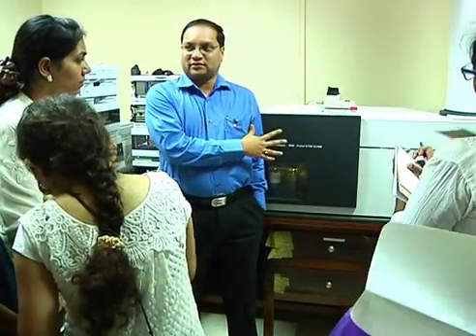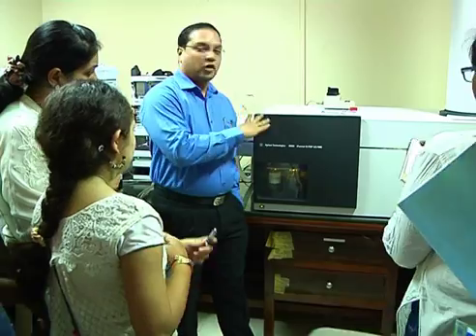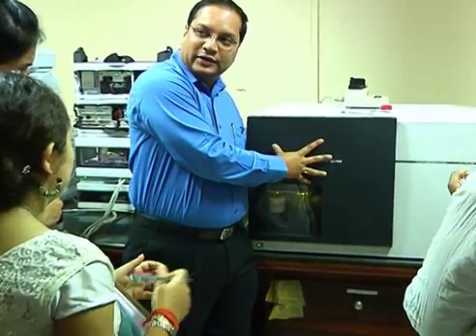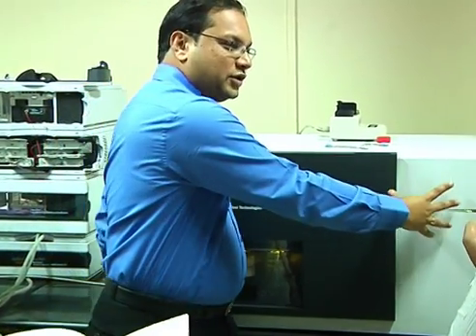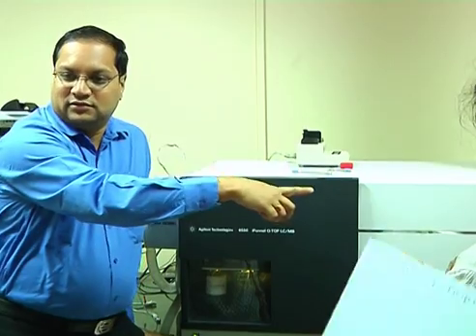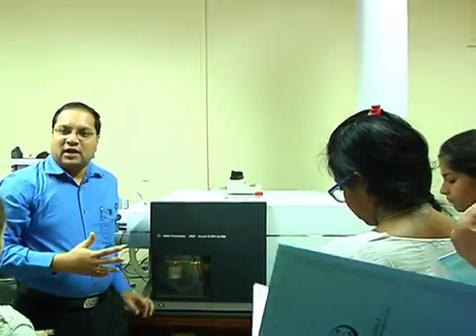This is the instrument, something like what we have seen in the schematics, a quadrupole time of flight type of instrument. Where you have a quadrupole, as I showed you in the presentation, then you have a collision cell, okay, and then you have a time of flight. Okay, so the quadrupole and time of flight are in tandem.